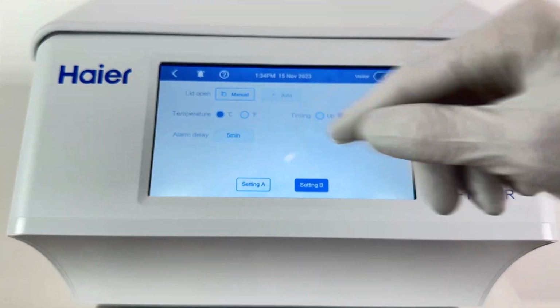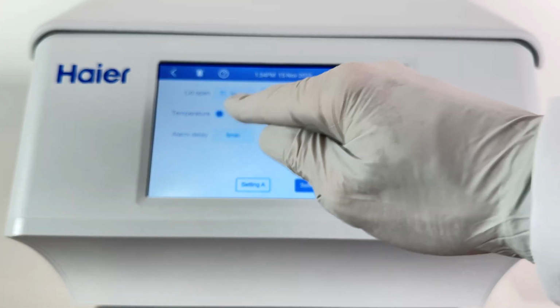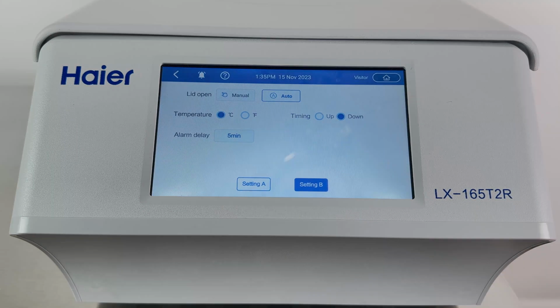Also, you can have the lid open manually, so you need to come and physically press it. Or if you're really trying to get super speedy workflows, you can have your lid open auto. So at the end of the run, when the rotor has stopped and it's safe, the lid will open up. Not really an issue here, but temperature, Celsius or Fahrenheit, and yeah, a delay alarm. So if you leave the lid open for more than 5 minutes, in refrigeration mode, it will give you an alarm to warn you: keep my lid closed, it's going to save you energy.